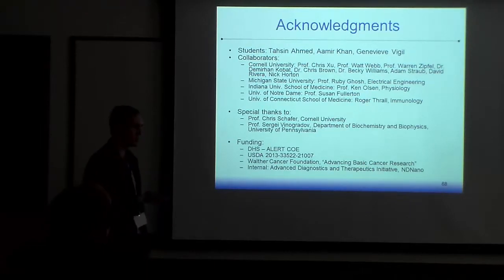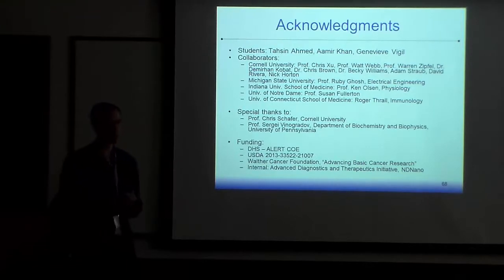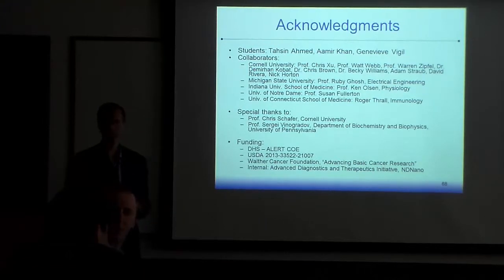Yeah, so that's the thing. For people who work with confocal microscopy, autofluorescence is annoying, but we like autofluorescence because it's a way for us to do label-free spectroscopy. So yes, there is a problem with autofluorescence, but people are trying to leverage it and use autofluorescence as a contrast mechanism. But autofluorescence can be pretty bright. Good questions. Thank you.